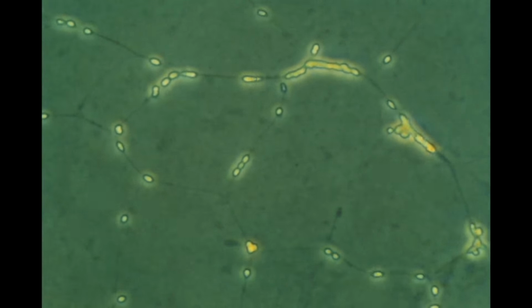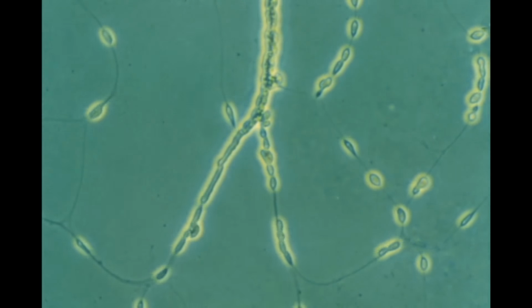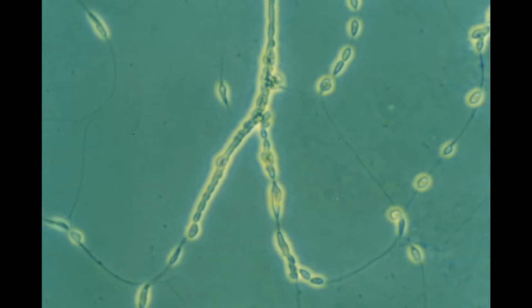Groups of cells appear to move in pulses. At any given time, all the cells in one area will move in the same direction, but there is no polarity to the individual cells. Either end may lead the way. Sometimes cells turn over as they move, or reverse their direction.